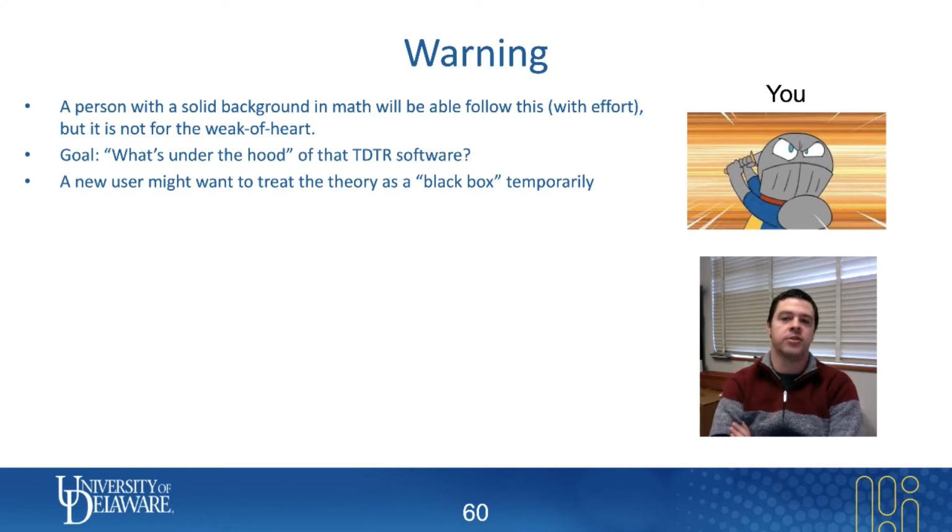I'm going to do my best to explain it not line by line, but explain some of the more challenging aspects of it. But it's not for the weak of heart, and it will require some intellectual effort on your part as well. So the goal is really to go through what's under the hood of time domain thermoreflectance software. And my word of warning is that a very new user who is just trying to get a basic idea of TDTR or trying to learn the ropes may want to come back to this part later and treat the time domain thermoreflectance software as a black box temporarily.